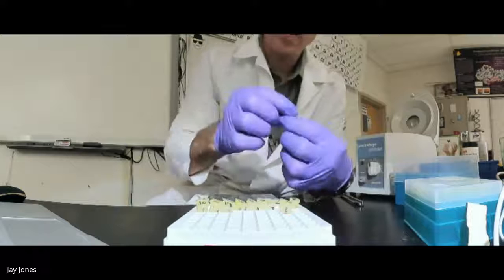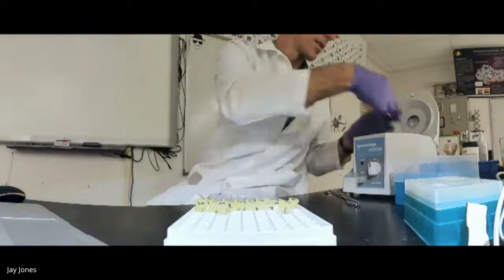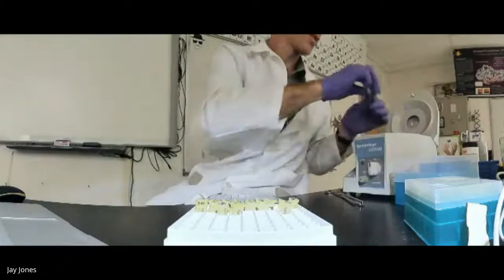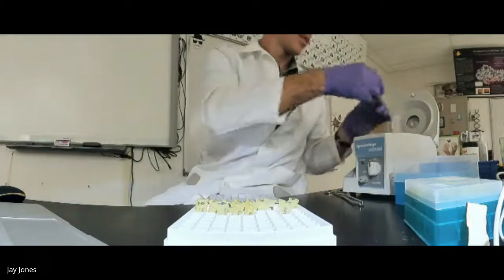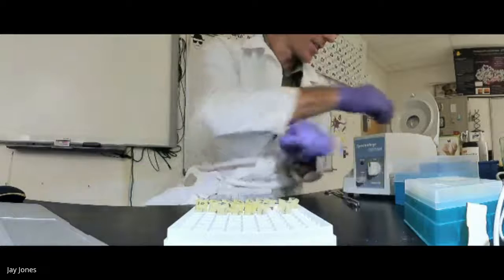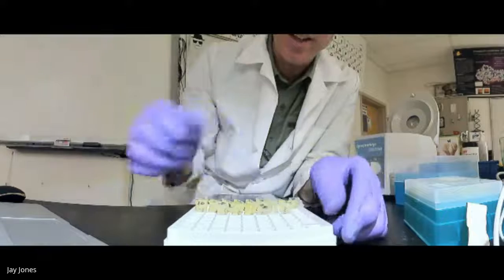This is spot 21, which is right there. Oh, looks good, though. In case you're wondering, it looks good. Spot 22 looks good. I saw DNA in there. It's good. Spot 23, which should be T3, P12, looks good. Spot 24, T5, looks good. And the last one, T4, T5, look at that. You've got the DNA. We did it.